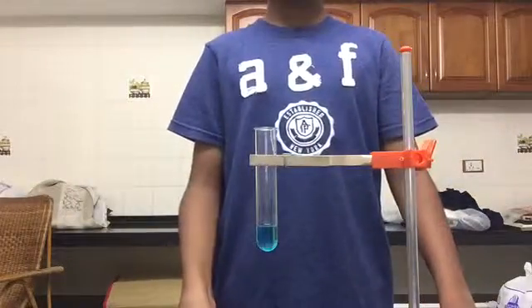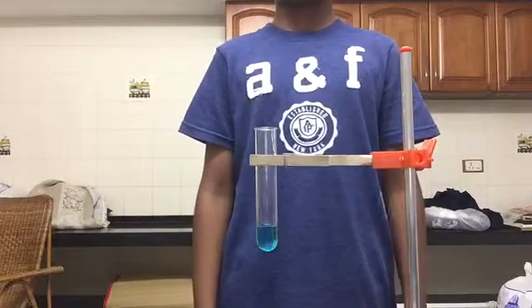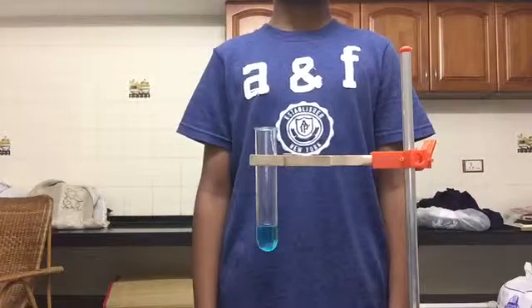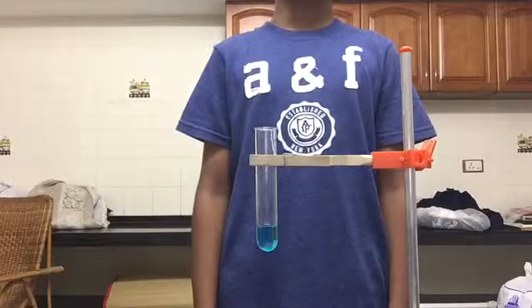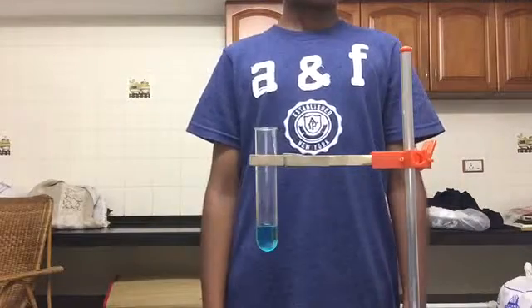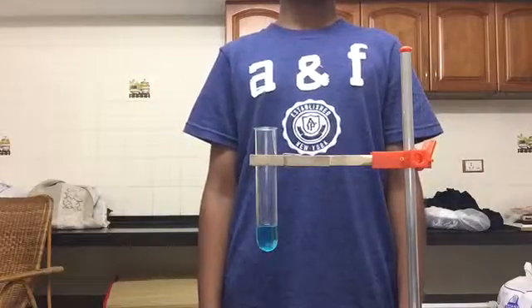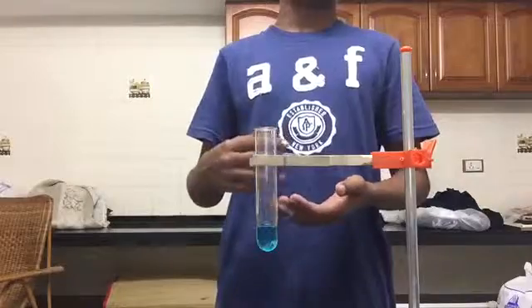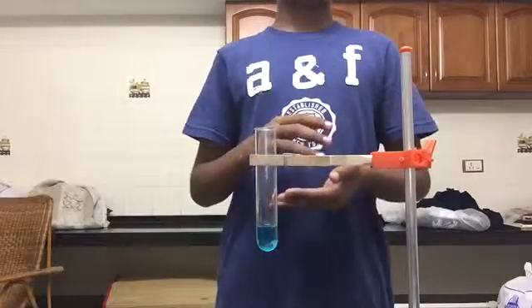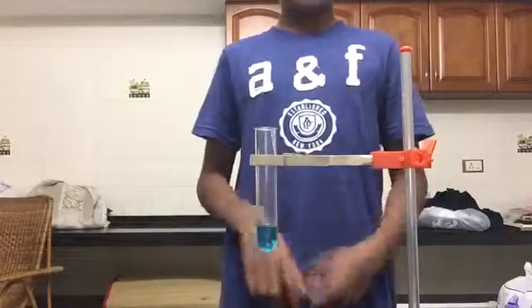Hi guys, welcome to Cool Chemistry once again. In this video I'm going to be showing you single displacement with the help of an experiment. We're going to be displacing copper sulfate using iron. Iron will be displacing copper sulfate because iron is more reactive than copper, and therefore it will be kicking out copper from the compound, making iron sulfate and giving out copper.